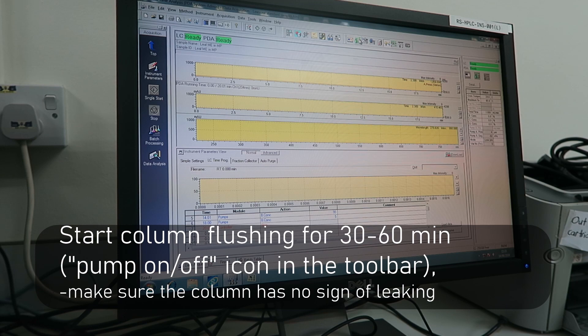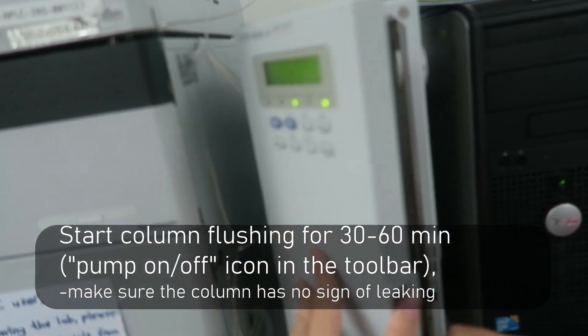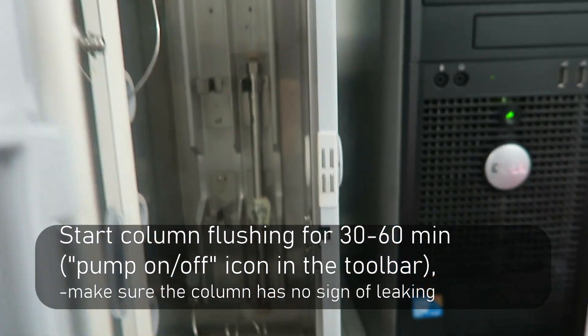Start the column flushing for 30 to 60 minutes by clicking on the pump on and off icon in the toolbar. Make sure that the column has no sign of leaking.